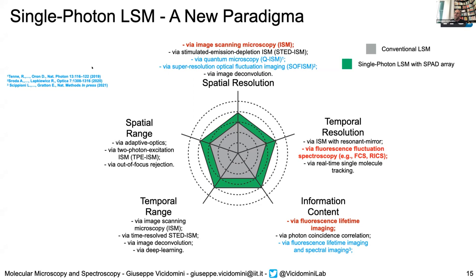So basically, we are confident that having such a detector, such a pixelated single photon detector in a confocal microscope, can be an advantage to get as much information as possible from the investigated sample. For a question of time, I cannot go through the whole project that we are currently running based on this system, but I just want to touch on a few of them.